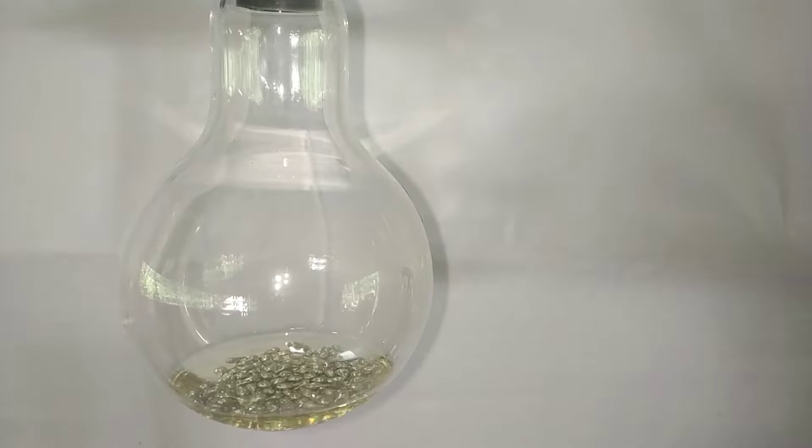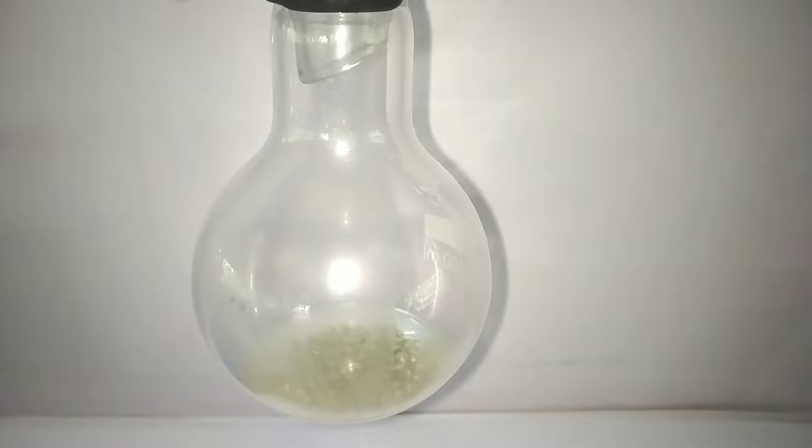Now attach a condenser over the flask and start refluxing the solution. Then add concentrated hydrochloric acid in small lots. I added about 7 ml of concentrated HCl at a time to prevent a vigorous reaction.